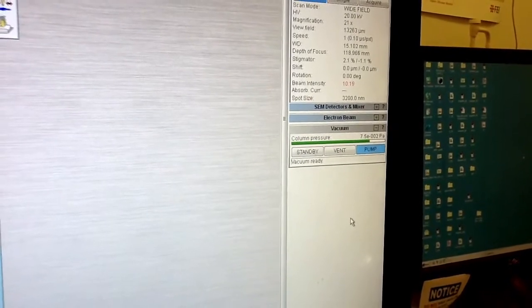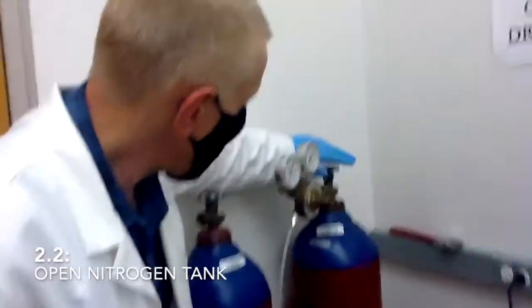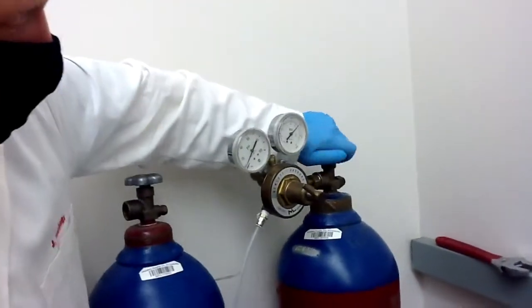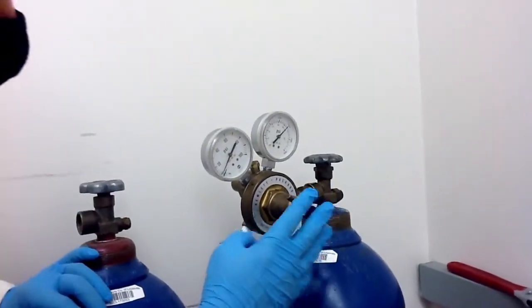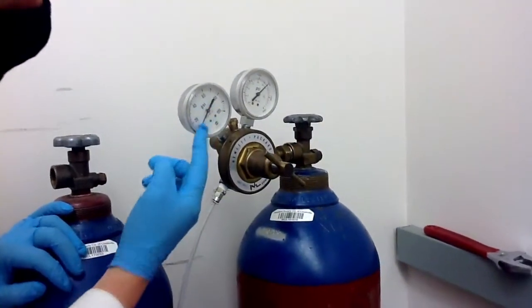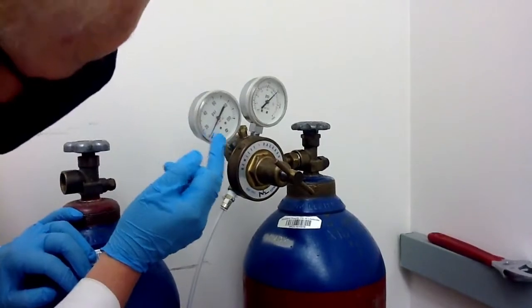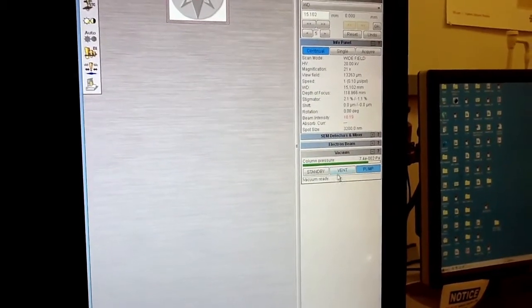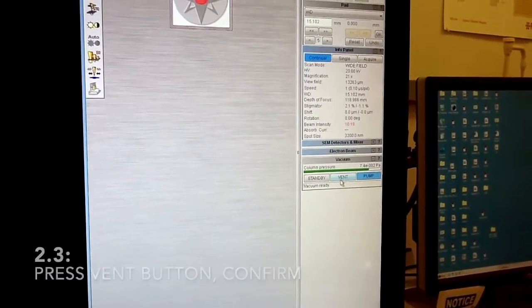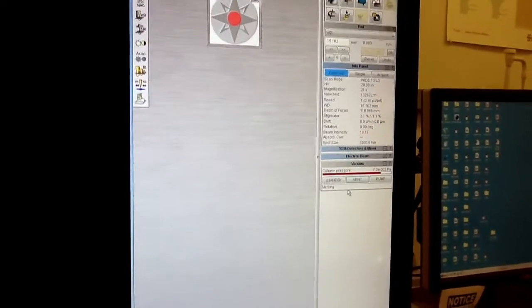Now if you have your sample ready, open the nitrogen tank — just open the main valve on the tank. Don't touch this valve, especially if the pressure is pre-set at about 10 PSI. When you have the nitrogen tank open you can vent the chamber. Just press the vent button and confirm that you want to vent the chamber, then wait a couple of seconds.